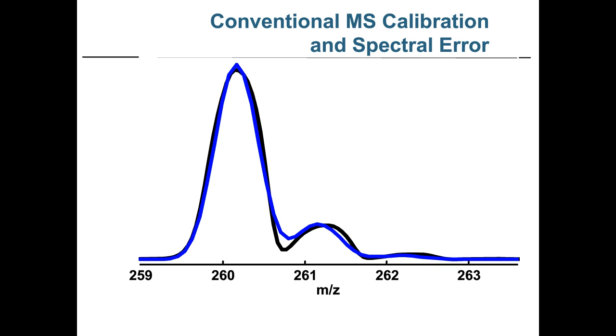But if we compare these two isotope profiles, since the instrument itself, the mass spectrometer, uses electromagnetic fields effectively as a lens, it's not a perfect lens by any stretch of the imagination. And so the actual line shape that's imposed upon the mass spec measurement is really undefined. It's not known.